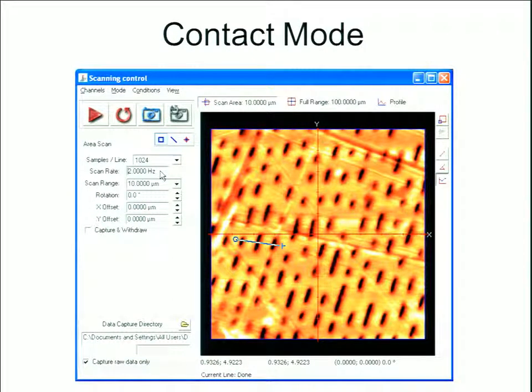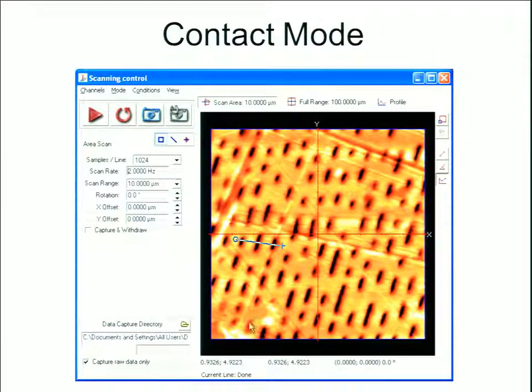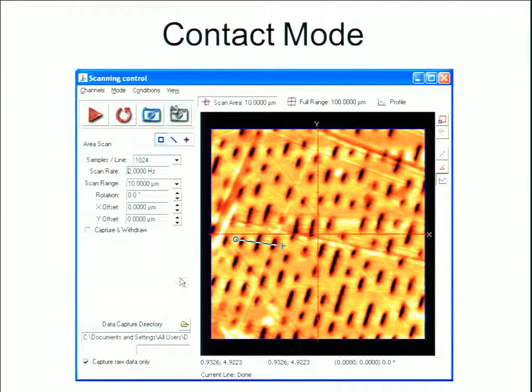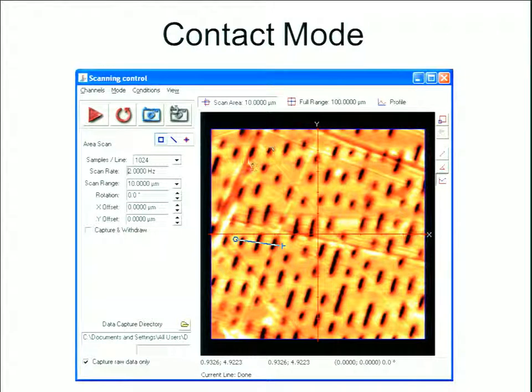The image was acquired with a scan rate of 2 Hz, which means it scanned two lines every second. There was no offset, so we just started from the bottom and scanned until finished.